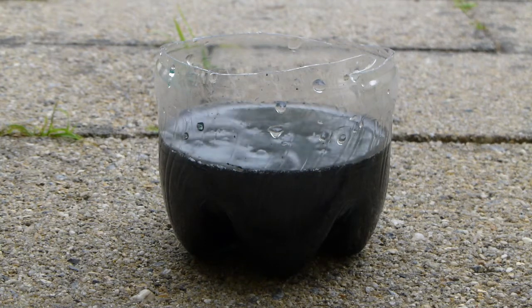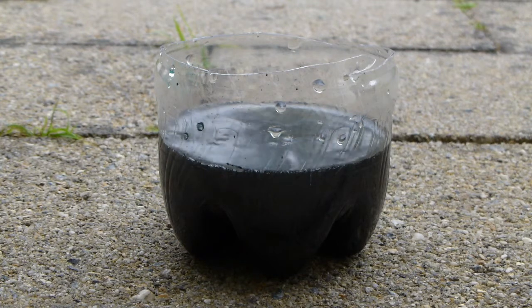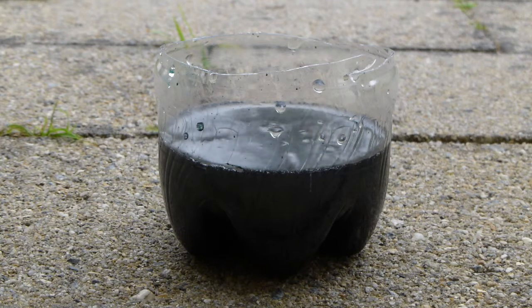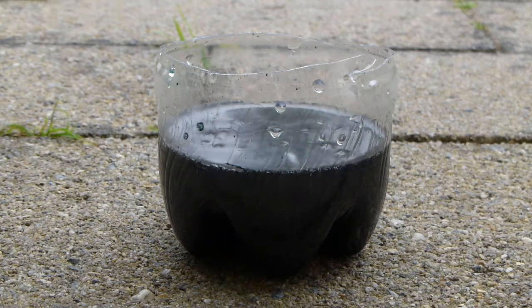Be very careful if you attempt to do this. The lithium may not be in prime condition because this is from a faulty battery. The battery registered the correct number of volts, but it wasn't possible to use it because of a very high internal resistance. If the lithium was good, it would probably bubble much more vigorously than this.